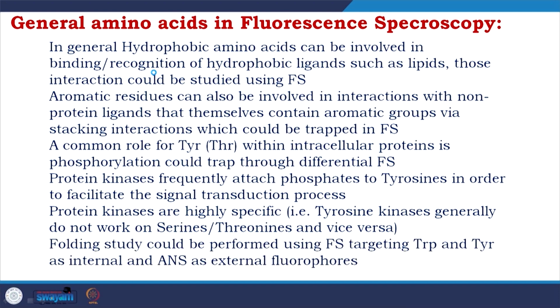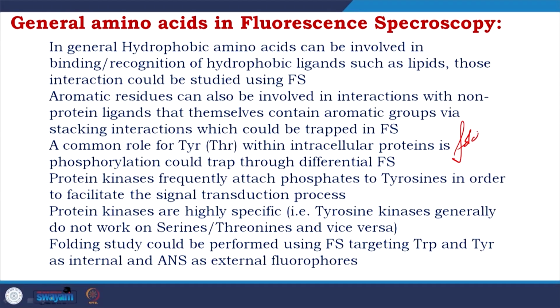Folding study could be performed using fluorescence spectroscopy targeting tryptophan mainly, but also tyrosine as internal and ANS as external fluorophore. I talked about whenever you are providing energy like thermal energy to the protein, what will happen? The soluble protein will start opening up, right. So, you have the folded state and you get unfolding, right.